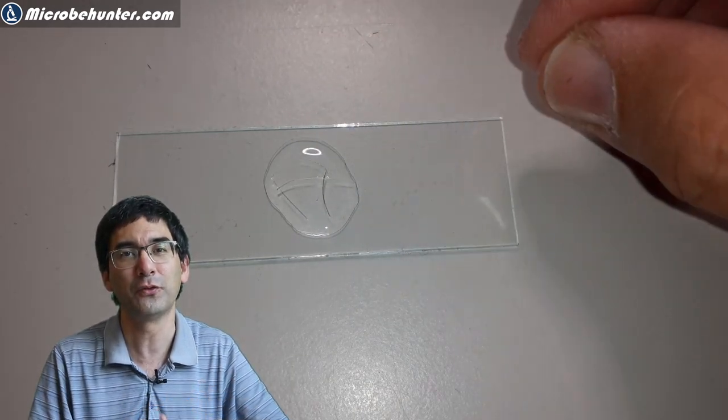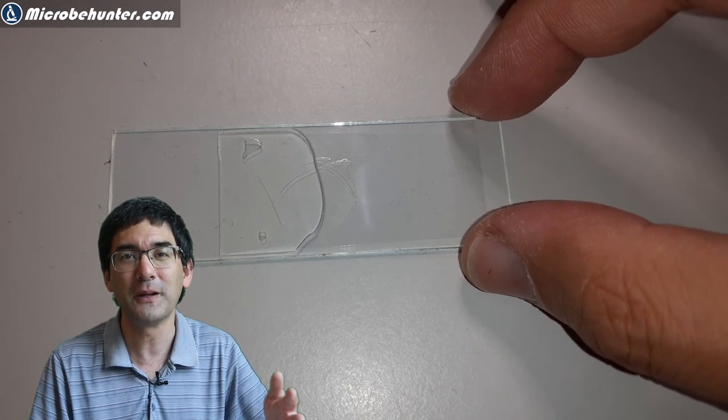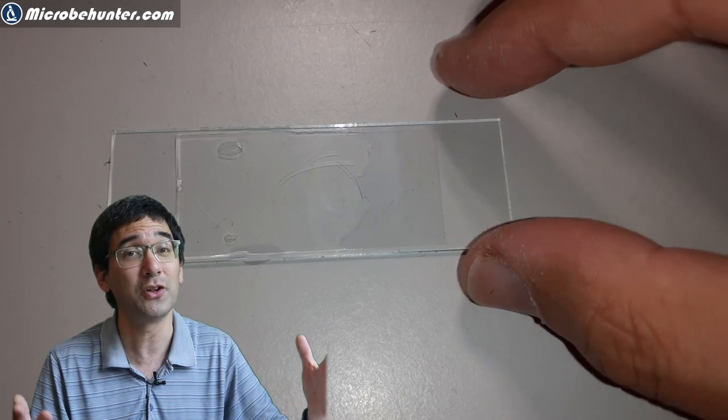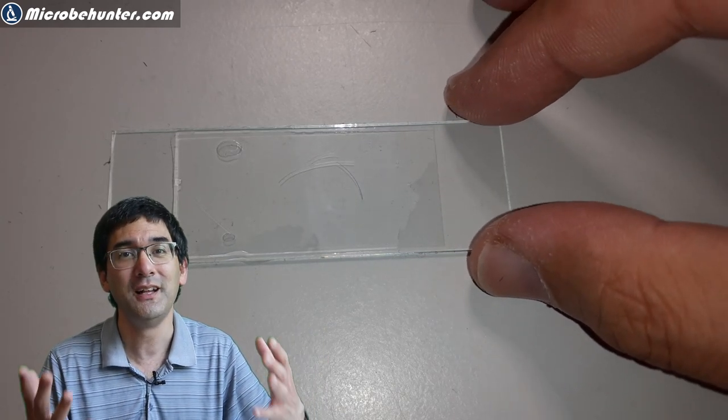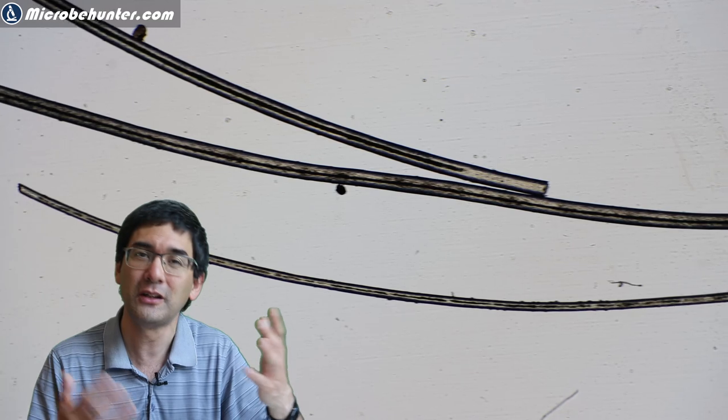Cover glass goes on top, and then I observed it directly under the microscope, first in bright field. This is where it's also possible to see that different hairs have different thickness. Maybe it depends on the age of the hair follicle. I don't know.